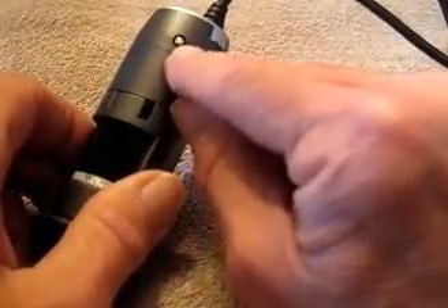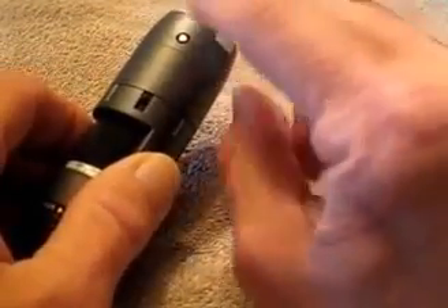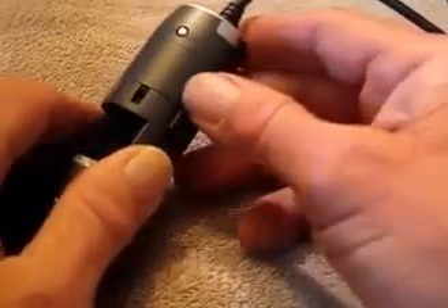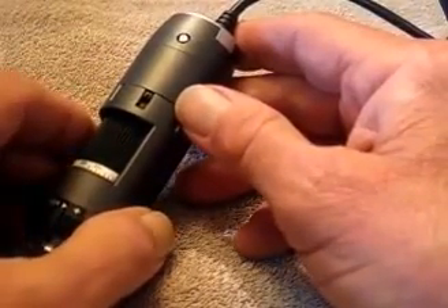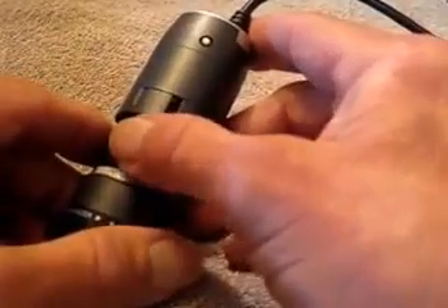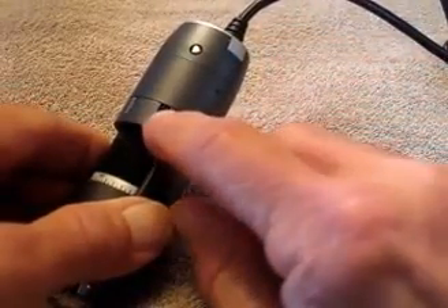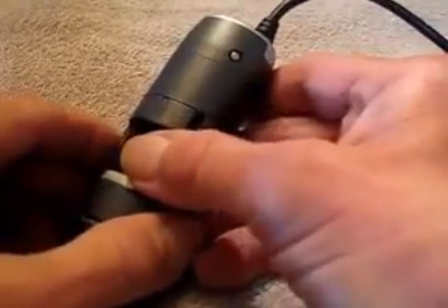Right here you have a little metal button — that's actually a capacitive sensor. If you have this feature turned on in the software, all you have to do is just touch it and it will take a picture. Really cool feature if you're doing it handheld. Also, when you adjust the magnification control, there's a small black button — you just slide that down and it will lock it so it won't change accidentally.